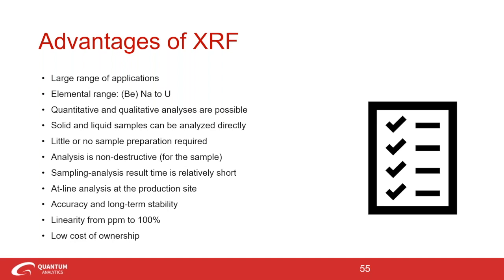One-time calibrations. There's no need to recalibrate daily, people. This is important. This is huge. XRF instruments are very stable over many, many weeks, even months. Daily routine samples include running your control sample, right? Just a daily check to verify both that the instrument and the calibration is working correctly. If there's any change in intensity, that can be corrected by running just a simple and quick drift correction.